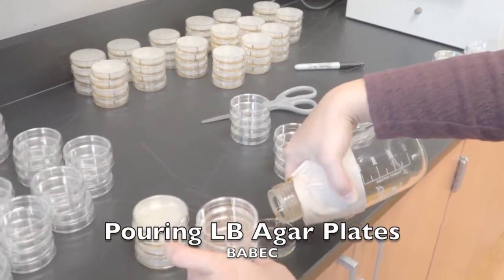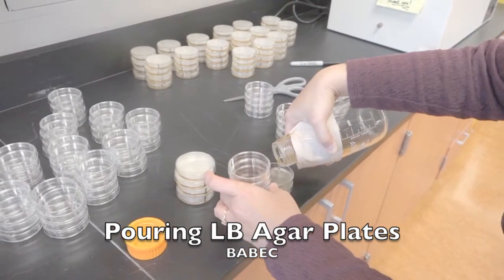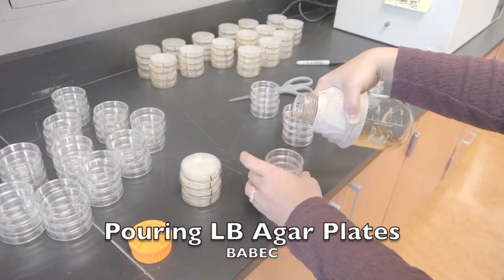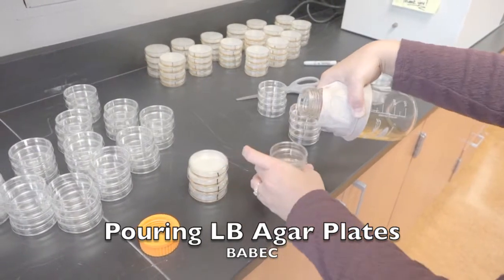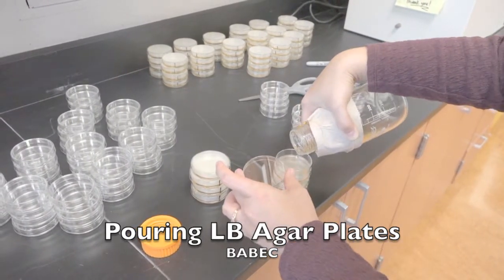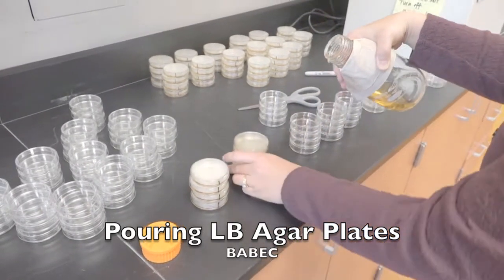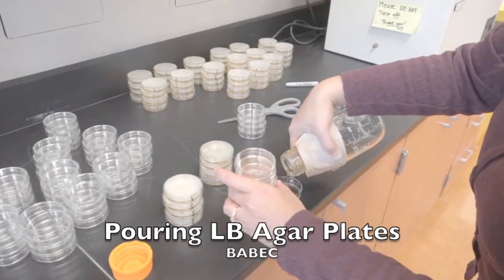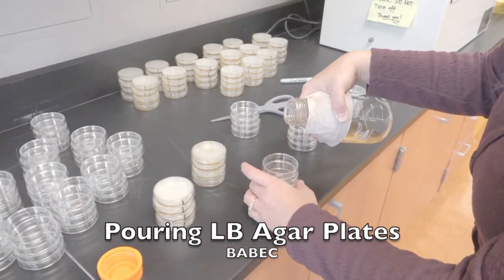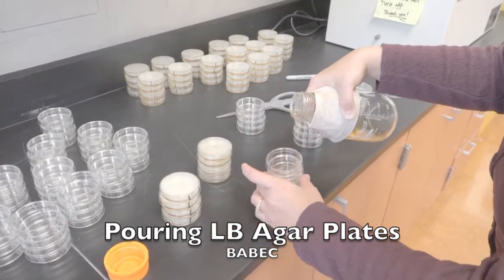Notice once you've poured a stack, you can't move it quickly out of the way. You have to move it more gingerly so that you're not splashing any LB agar onto the top of the dish. If you do that, then you're forming a way for microbes to get into your dish, and all the microbes love LB agar so they can grow into it very easily.